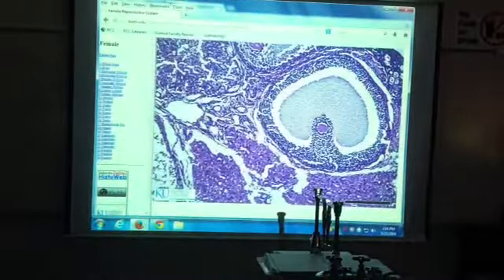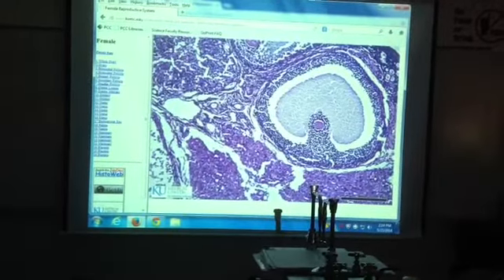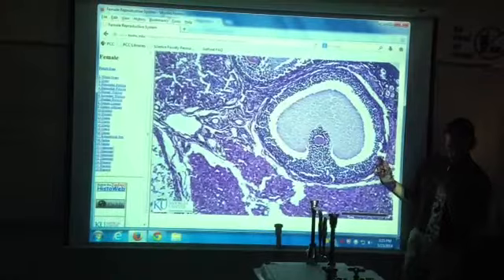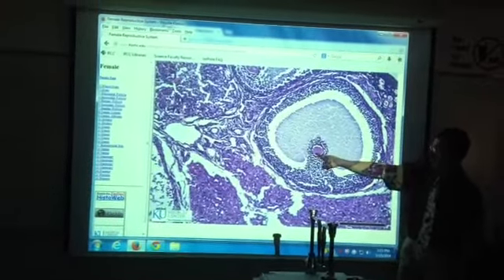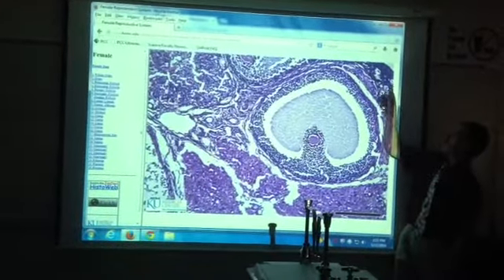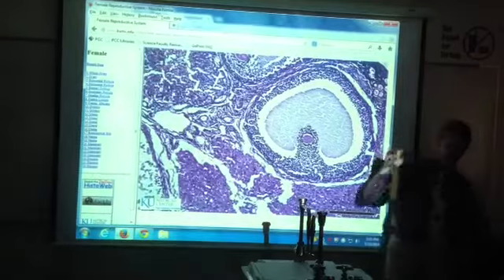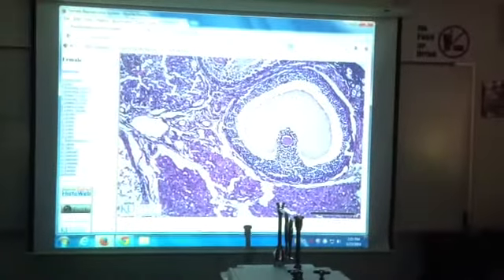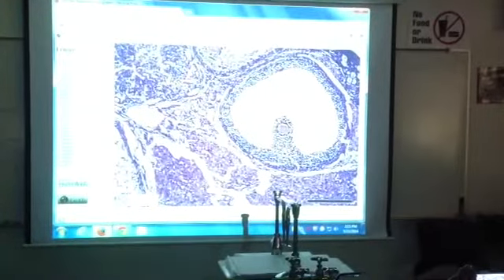So then our last one, my favorite. The one that's full of fluid with the egg on the side. So this follicle is mature, Graafian, vesicular. That egg is secondary. Here's some little primordials over here. Right. So you're going to have to name the cells and the egg separately in your head as you go up the chain. Make sense?